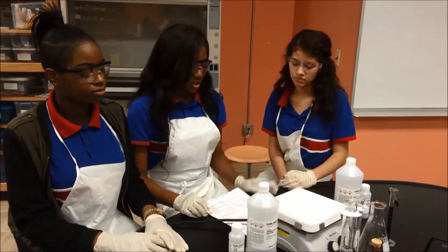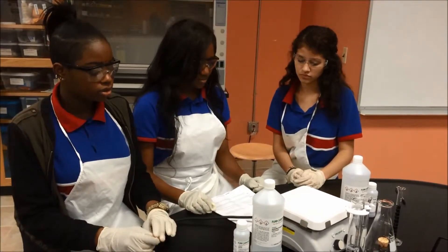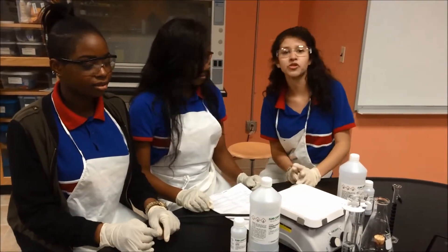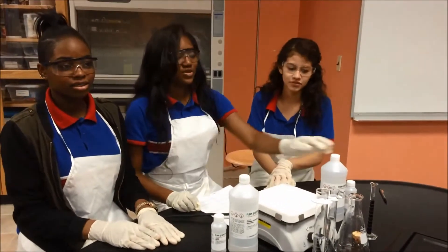The materials used for this: we use dextrose solution, indigo carmine solution, we also use sodium hydroxide solution, and an Erlenmeyer flask. We use two graduated cylinders, one with 100 milliliters and one with 10, and a stopper to fit the flask.